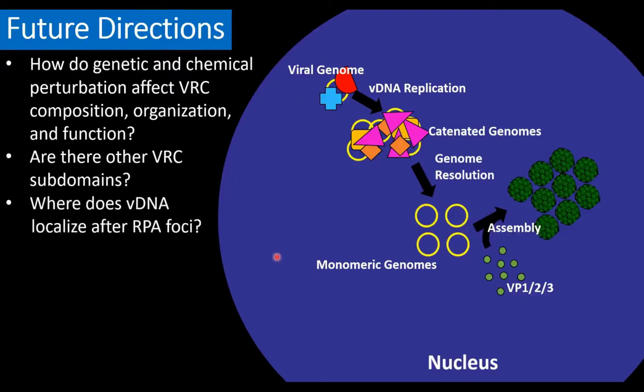Where does viral DNA localize after RPA foci? The EdU pulse-chase experiments I showed you today only went as far as this genome resolution step, we think. We don't know at this point where viral DNA localizes after it leaves RPA foci. So we're working on pushing that pulse-chase experiment further down the pipeline to see where viral DNA localizes and with what proteins it associates.